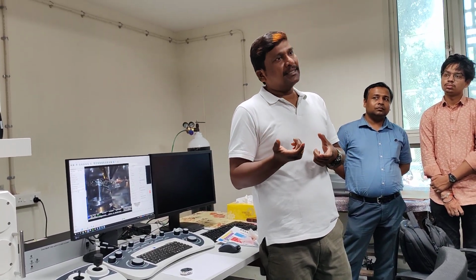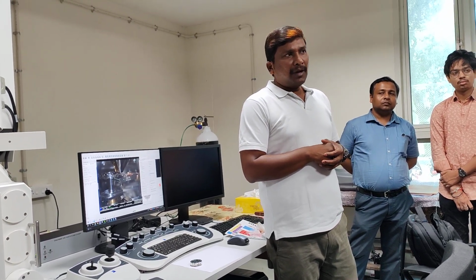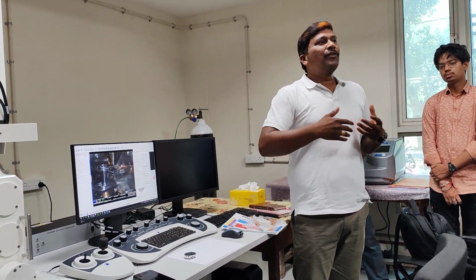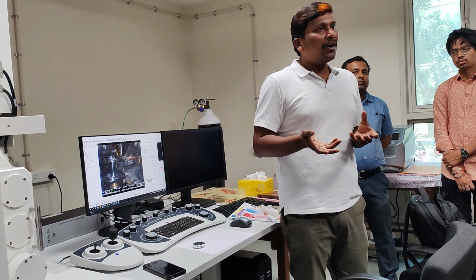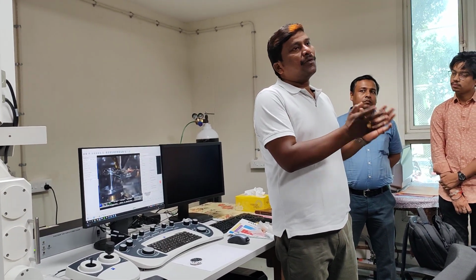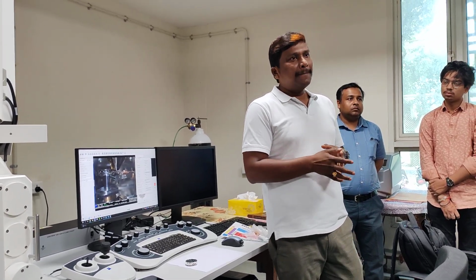Is there any restriction on the solvents used for drop casting? Whatever solvent you use, we will take it only after drying. If you use a water base, drying will take a lot of time. If you have an alcohol base, it is easy to dry. But it should not affect your particle size, your chemistry, or the morphology of your sample. You have to keep such a buffer.